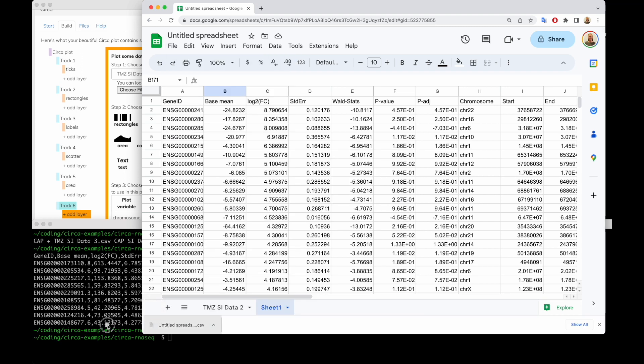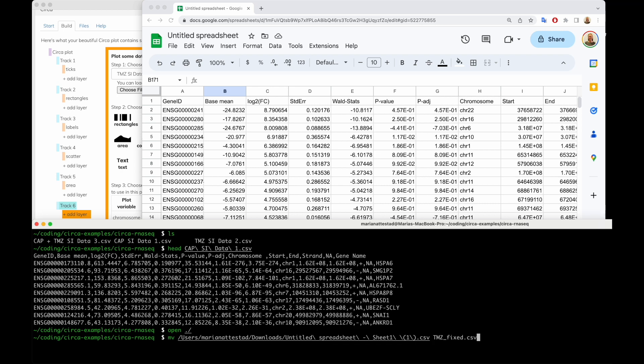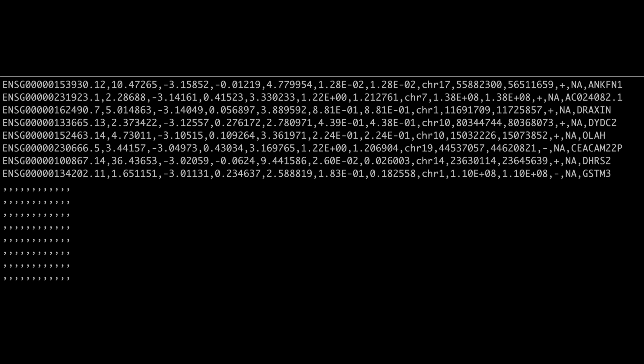I'm going to copy this onto the command line and move it into this folder — I'll name it TMZ_NA_filtered.csv. It's good to be exact. This file also had another issue: a bunch of empty rows at the bottom, but that was also fixed by simply importing into Google Sheets and exporting again. That's why none of the columns showed up as numbers at all — it wasn't just the NAs, it was mostly the empty rows that prevented all the columns from showing up.